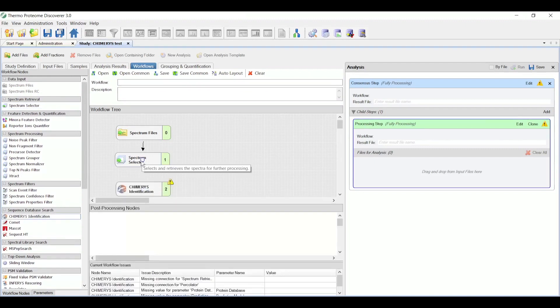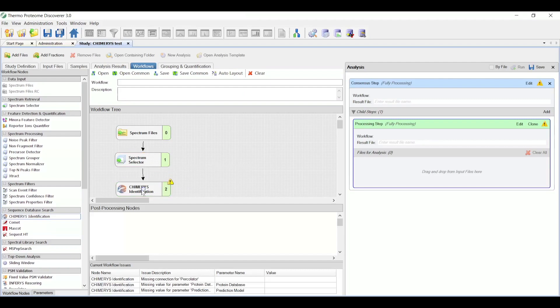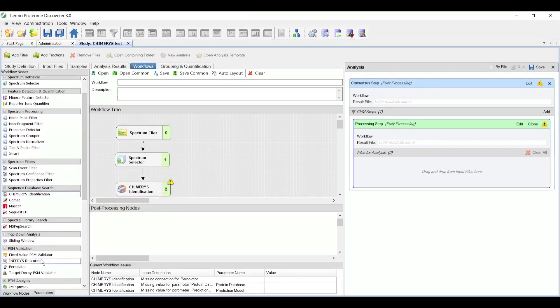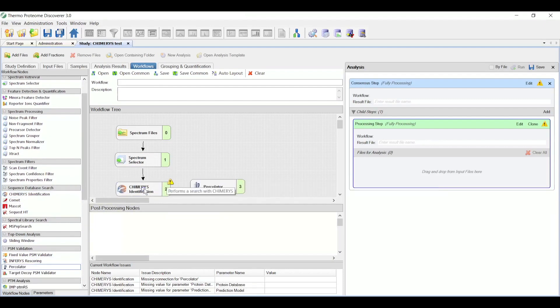Chimera's identification node, which submits the data for search on the Chimera service. And finally, a percolator node, which is used for the FDR calculation. And of course, I need to connect these nodes together by arrow.